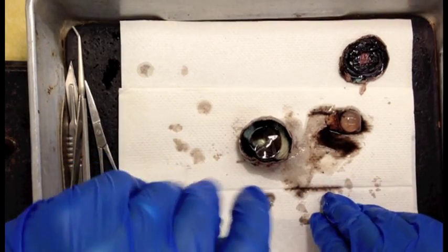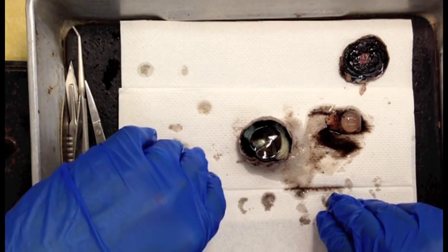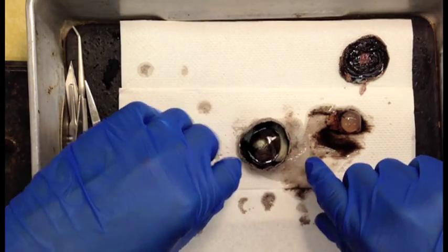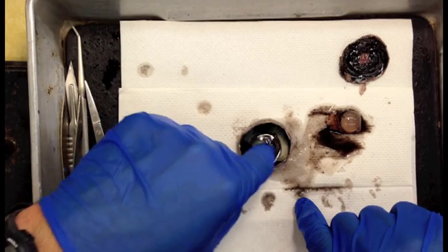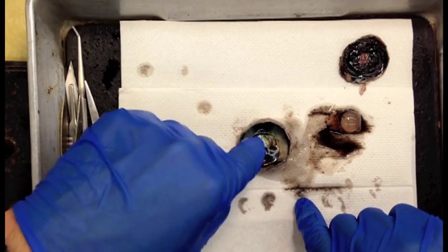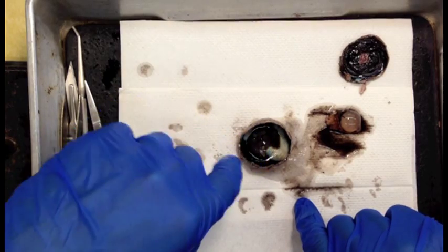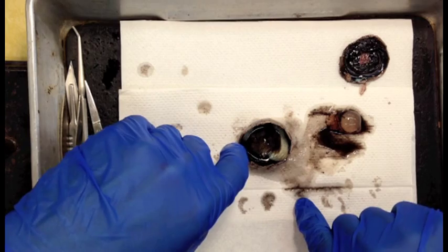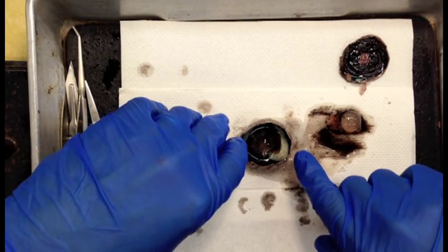The vitreous humor is much thicker, almost like a jelly, compared to the aqueous humor that was in the anterior chamber. So let's go ahead and look inside this posterior chamber. And right in the middle, there's this sort of light brown material. It looks like it's sort of floating in there, almost like it's completely separated from the eye itself. In fact, most of it is. This is the retina.